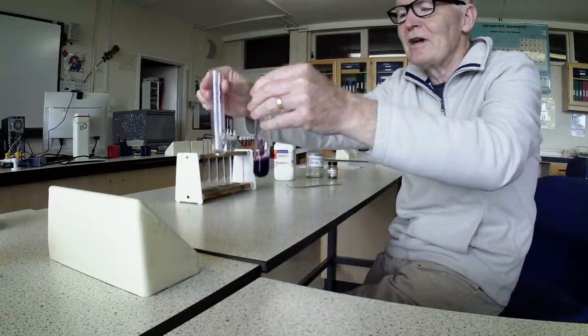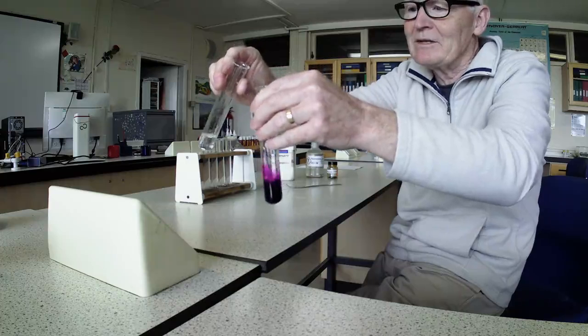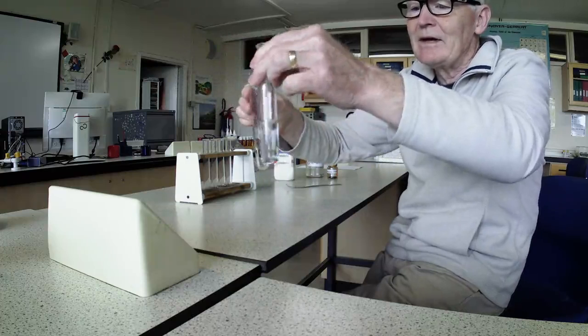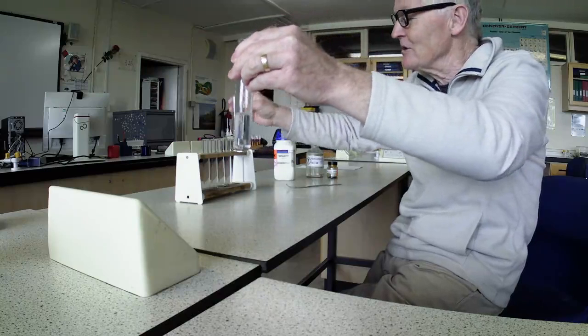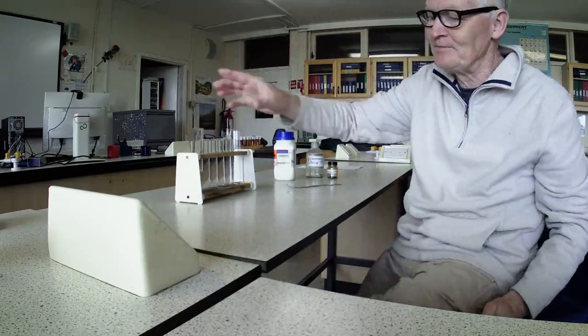So now the first reaction is just to coat the sodium sulfite in with the permanganate solution. And we get an immediate colour change. So that is one of the things that a chemical reaction can give. A chemical reaction can give a colour change.